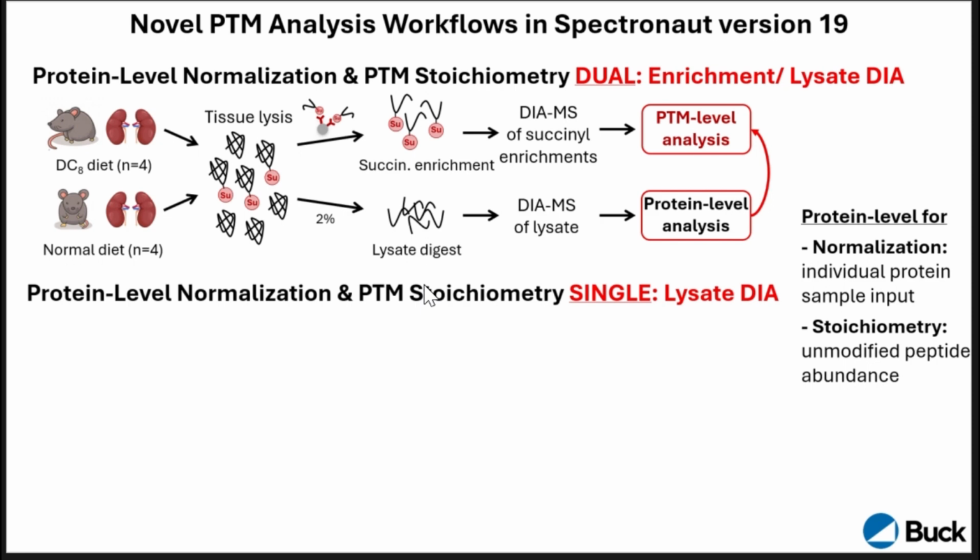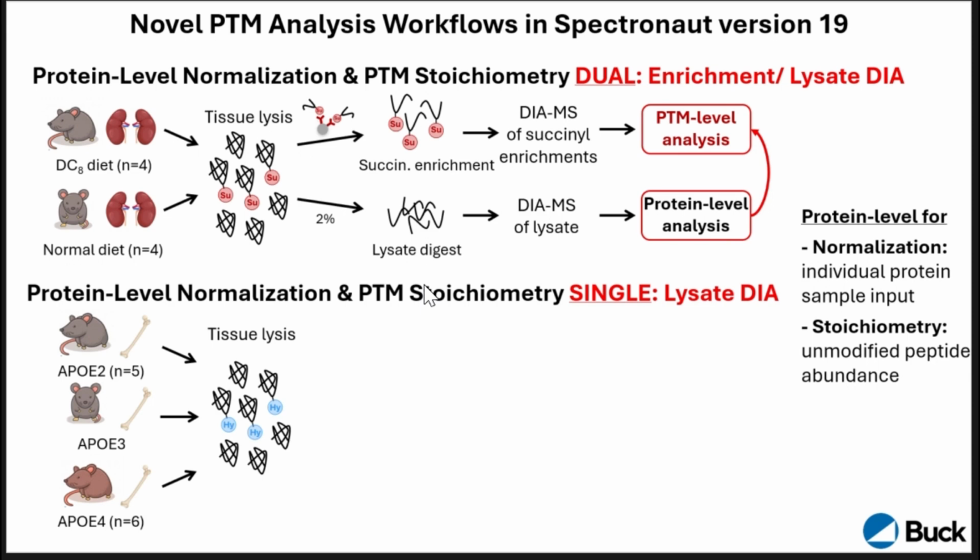So when you do the normalization, you can decipher really the PTM regulation. So we do that a lot, actually. And then the other example I show you will be about some bone proteomics.